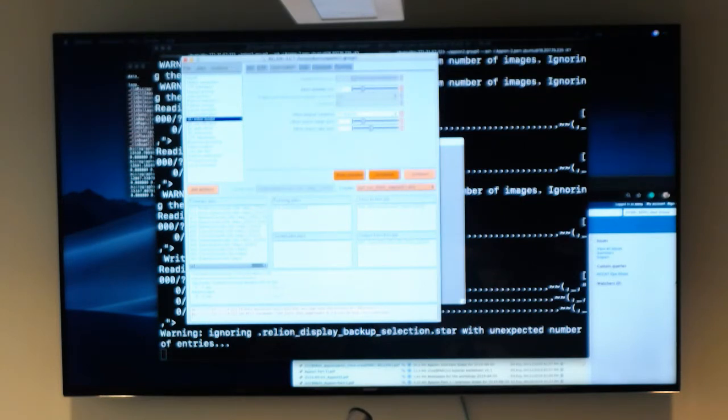Towards the end of the workshop, what I hope you will have time to do is start playing and change certain parameters and see how that impacts the result. It's useful to do this on a test data set when you have a known result. For example, what happens if I make the diameter really tight or not for a mask? I know my particle should be X diameter. Now, what if I make it tighter, larger, smaller? Masks, if you have a hard edge, might introduce artifacts during alignment.